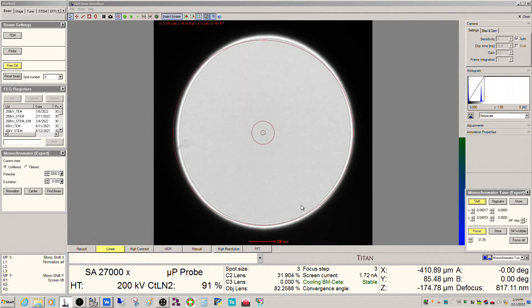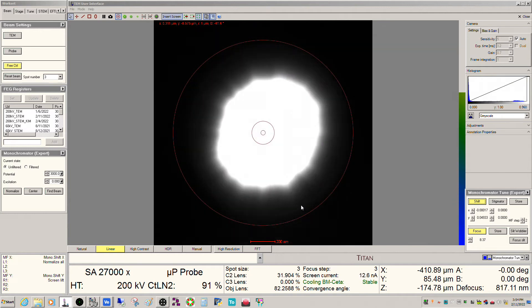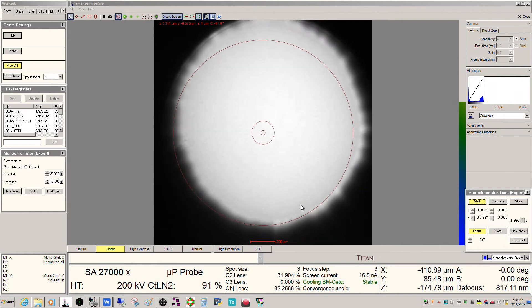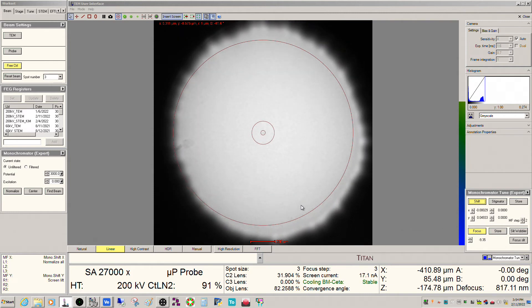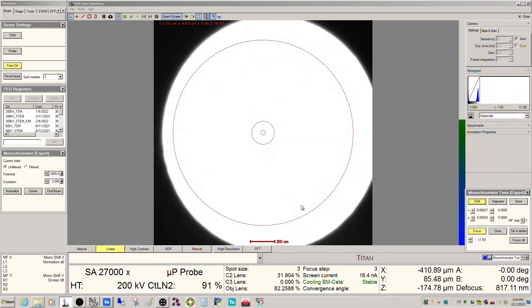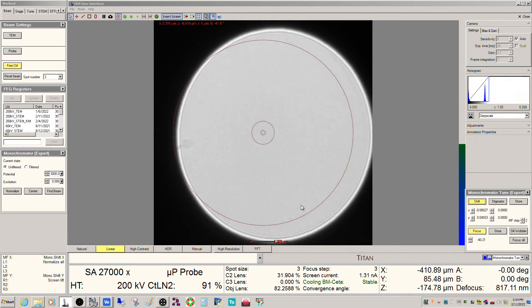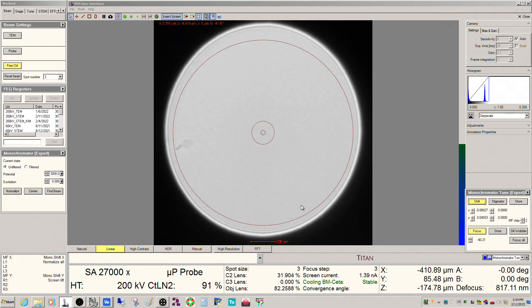If you're going to do regular imaging, you want to go on the other side — you want to go negative. Same thing though: you're going to need to adjust the shifts to make sure it's centered inside the aperture. I use usually negative 40, so 40 either way, just negative versus positive. This gives me about a nanoamp and a half for the current, which is usually pretty good for doing conventional work.